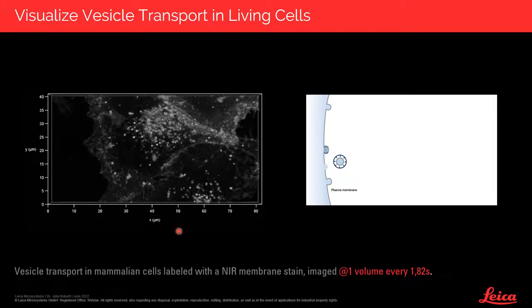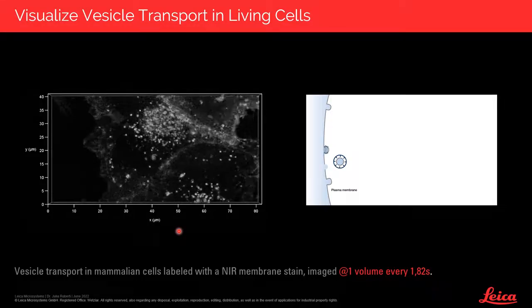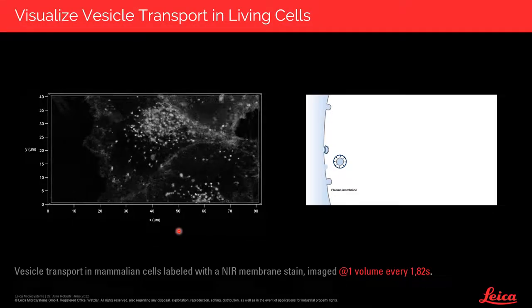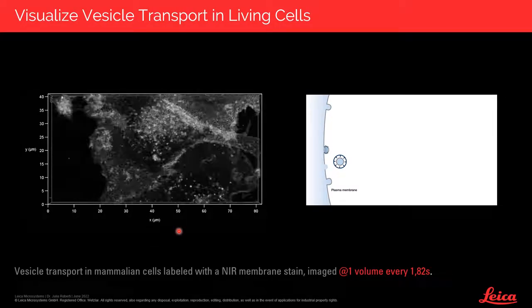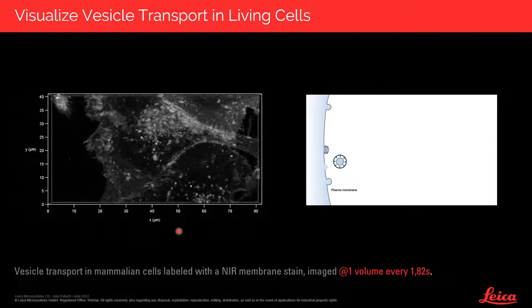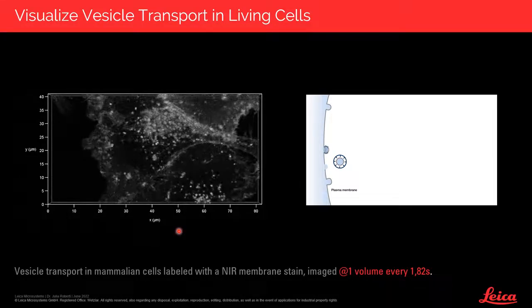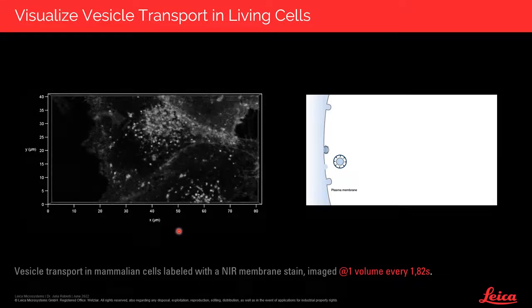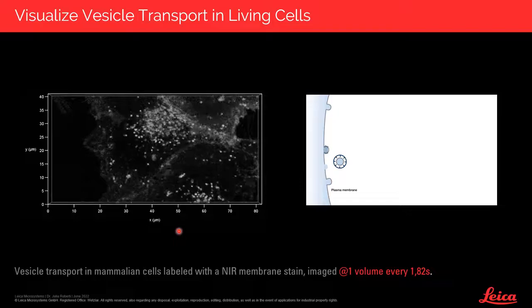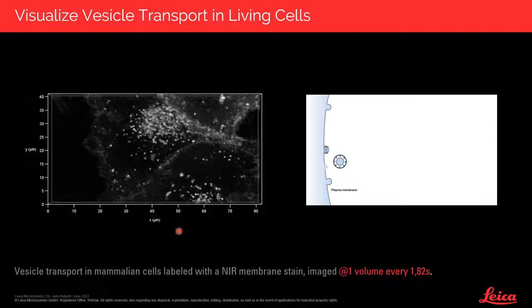These kinds of experiments are typical when one performs studies on the endocytic pathway, which is super relevant to many different processes like cell dynamics, signaling, growth, and also host-pathogen interactions. That is a very hot topic nowadays because many animal viruses enter host cells via endocytosis.